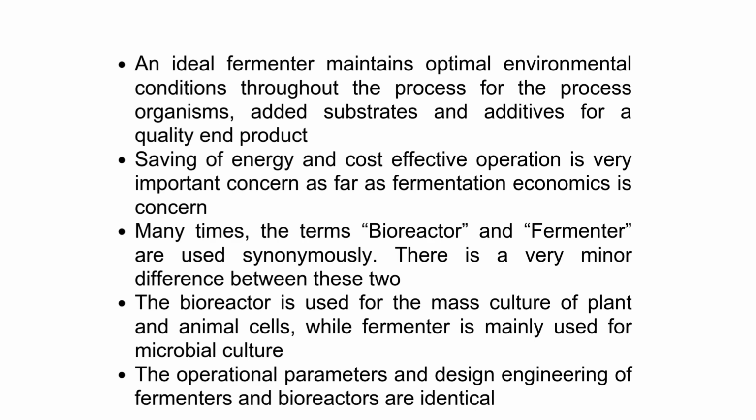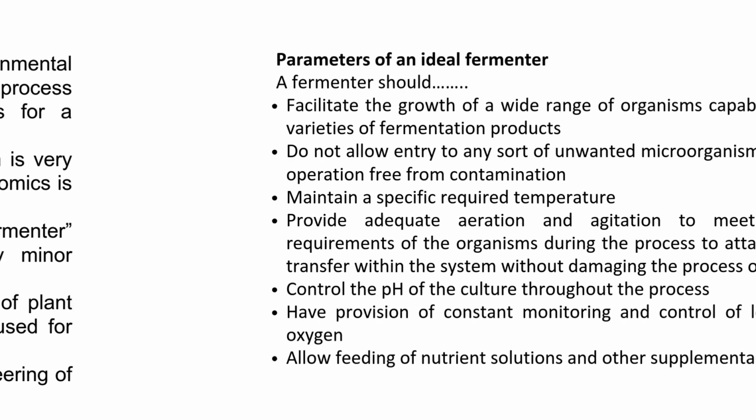You'll often hear the terms bioreactor and fermenter used interchangeably. While they are very similar, there is a minor difference. A bioreactor is typically used for the mass culture of plant and animal cells, while a fermenter is mainly used for microbial culture. However, their operational parameters and design engineering are largely identical.